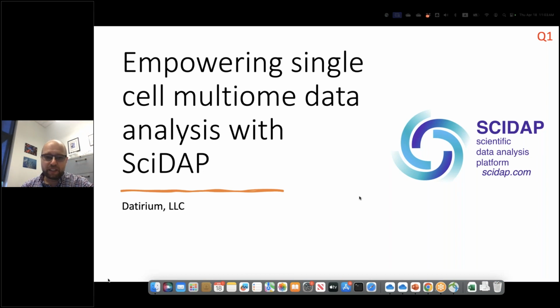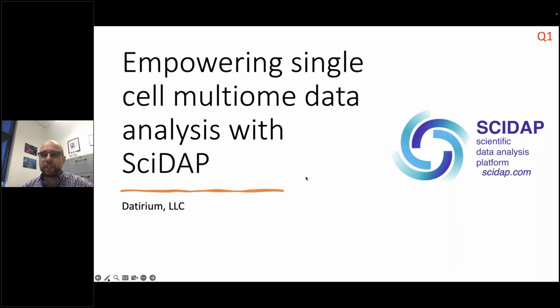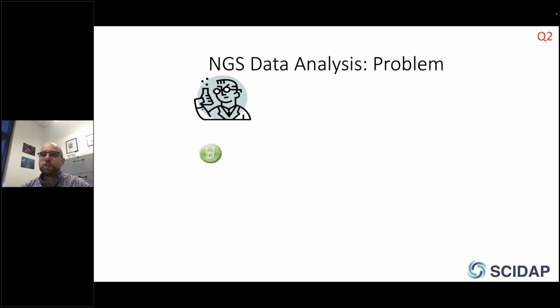We started our platform initially for ourselves. As Jillian mentioned, I am an associate professor at Cincinnati Children's, where we study epigenomics of T-cell memory. And of course, with all the omics studies, we produce a lot of NGS data. This is why we needed a quick way to analyze it.